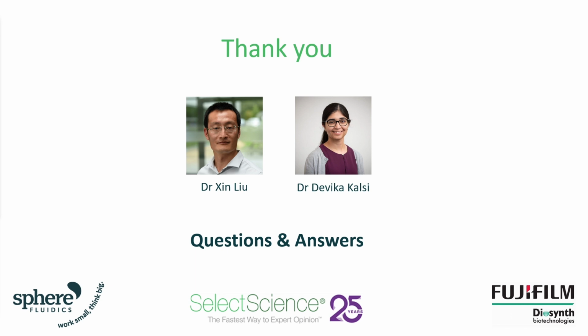Thanks. Did you have anything to add to that, Devika? I think in the biologics field, we are seeing different sorts of molecules coming through now, so more complex ones such as the bispecifics. So I think being able to monitor titer levels for those kinds of molecules would be, again, something that industry is now focusing on.